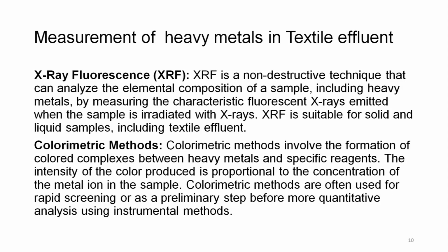X-ray fluorescence, XRF. This is a new technique, new learning. XRF is a non-destructive technique that can analyze the elemental composition of the sample, including heavy metals, by measuring the characteristic fluorescent X-rays emitted when the sample is irradiated with X-rays. XRF is suitable for solid and liquid samples, including textile effluent.